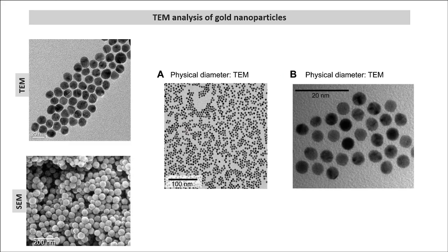All right. Now these are the same images. Compare these two images. You can clearly see this is a 2D image, this is a 3D image, this is how it looks. One important thing: if you look at the scanning electron microscopic analysis of these nanoparticles, maybe you cannot clearly predict that most of the nanoparticles are of exact diameter because this is in 3D.